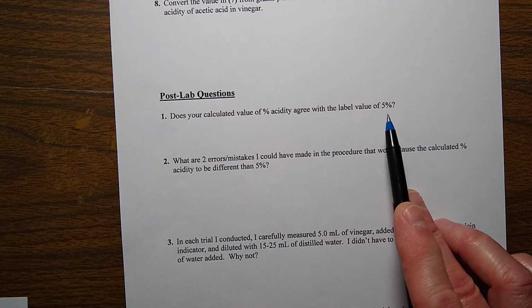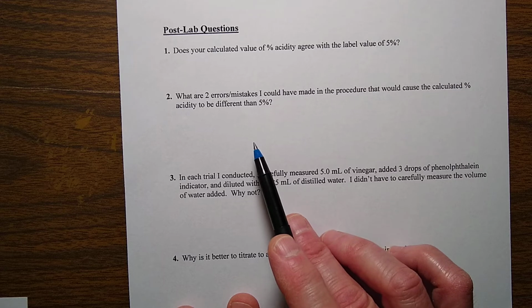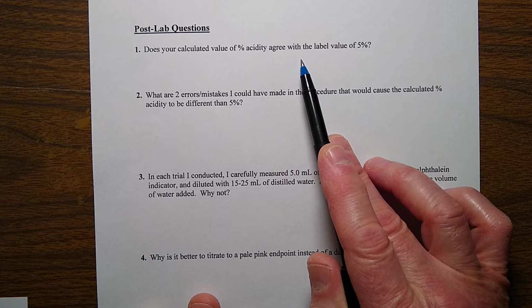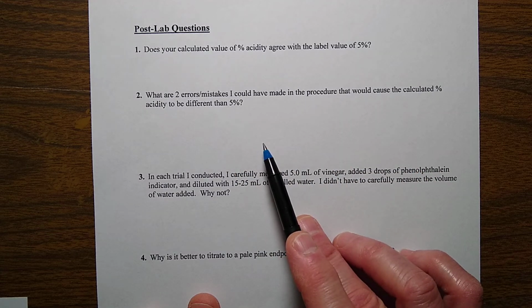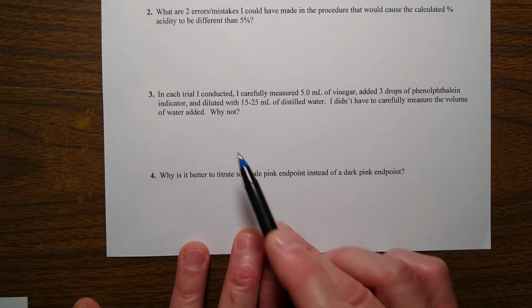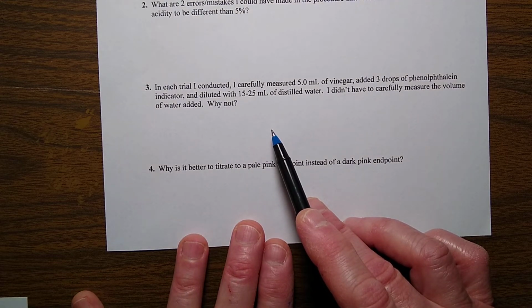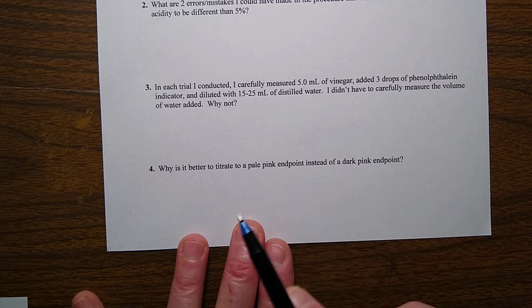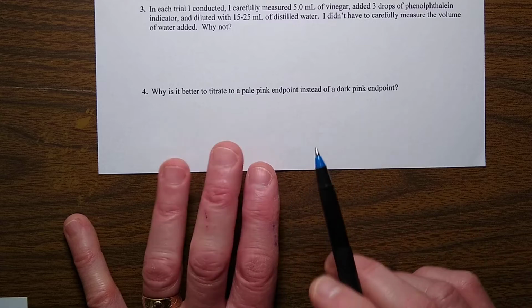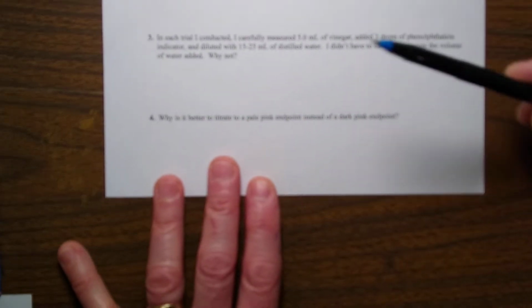And then I have some post-lab questions asking you about does the calculated value of percent acidity that you calculated here agree with the label, 5% on the bottle. I want you to think about what sources of error I could have made that would cause this number to not be what the bottle says. Think about what I did, what you would do if you ran this lab, where mistakes might be made, and that would cause the molarity and eventually the percent to be high or low. And then I ask you about why adding water isn't important overall, why it doesn't matter, and why it is better to titrate to a pale pink endpoint instead of a dark pink endpoint. So these don't have to be long answers. The space I give you is more than enough to answer those questions.